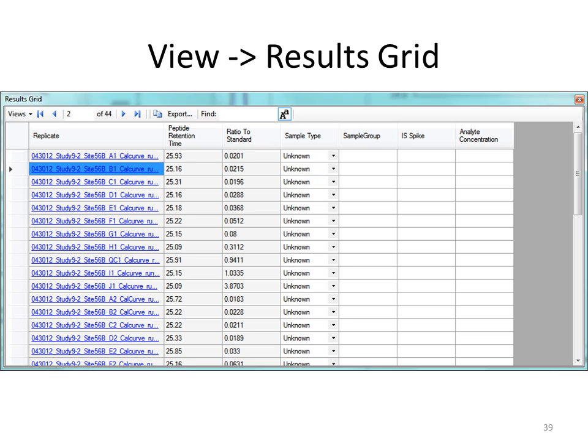And you may need to be clicked on a peptide, the peptide sequence. So just pick the first one. You got it, okay. Great. This results grid view will change if you are on a peptide sequence or its precursor or a product ion. For this, just make sure you have that first peptide selected, and then you should see everything the same as here. Okay. Everybody good?